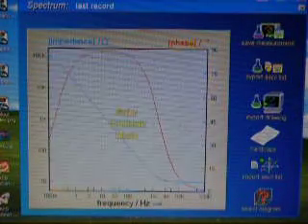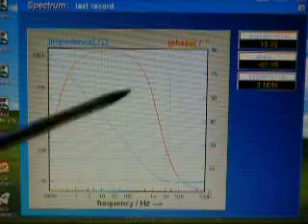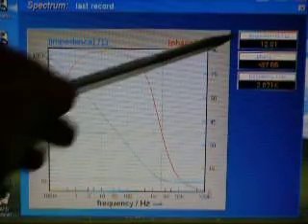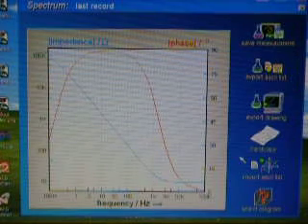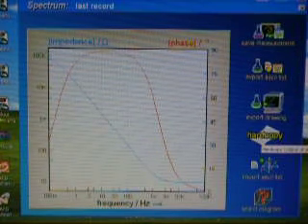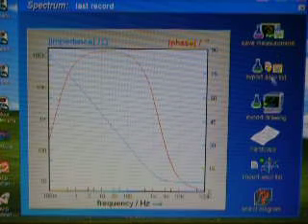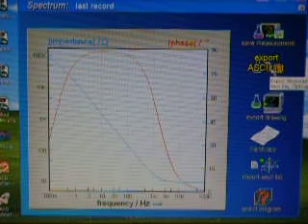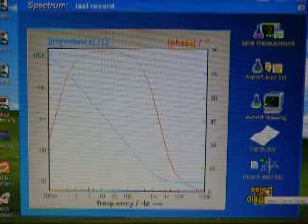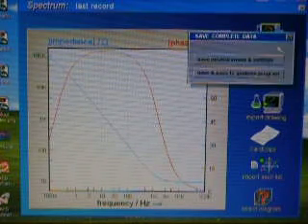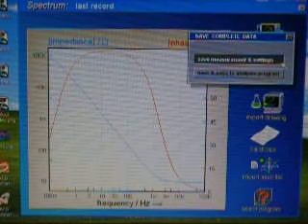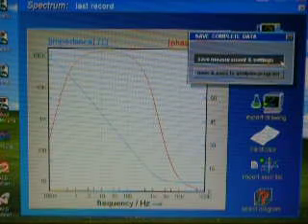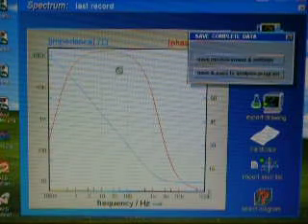At the end of the scan we're given the choice to see the data. We can go into an active crosshair mode and as we move the crosshairs these numbers will update in real-time. We can go to hard copy printout, export the drawing to a CAD function, export an ASCII list, import an ASCII list, and select the type of curves or display modes. We can click save measurement and it'll save the measurement and the settings, so when you write a script, all you have to do is recall a data file and all of the settings will come back with it.